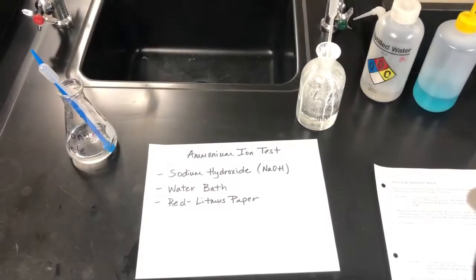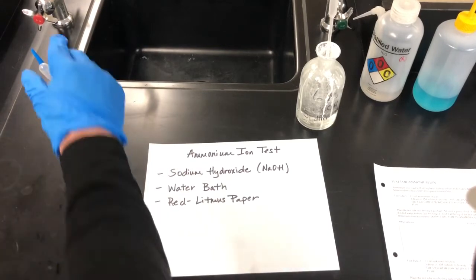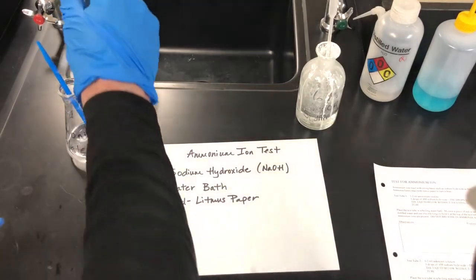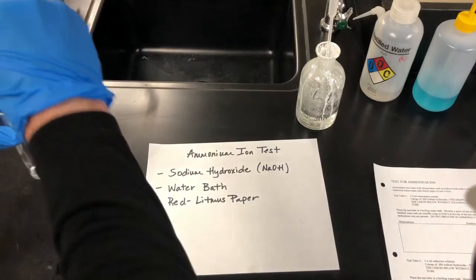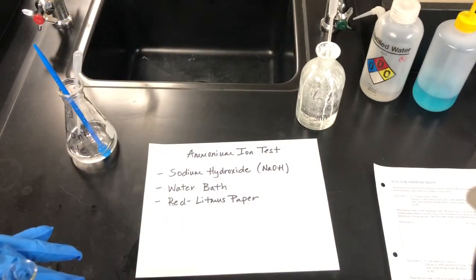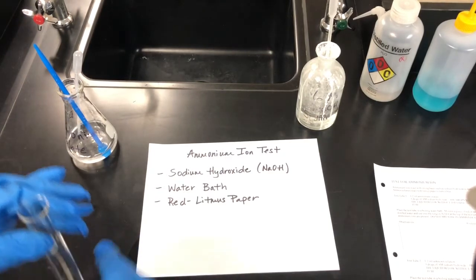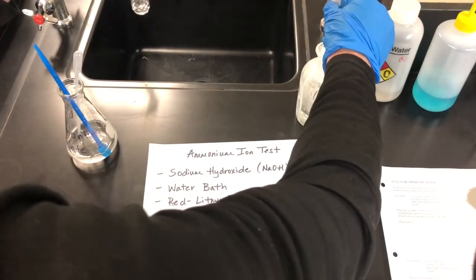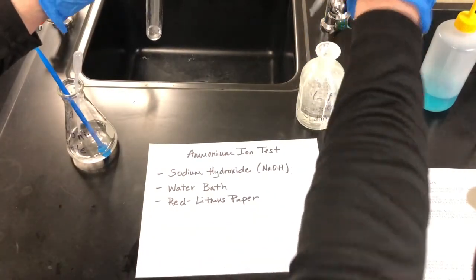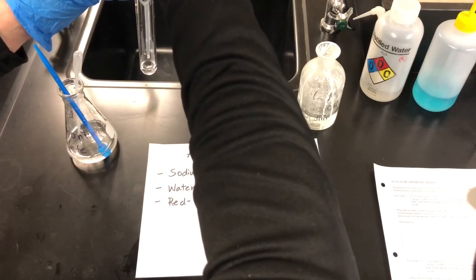Okay, so the last test we're going to look at is the ammonium ion test. The top box says that we're going to take 1 to 2 milliliters of ammonium oxalate. So I'm going to take a squirt of that, put it in my test tube. And it says we're going to mix in 3 drops of sodium hydroxide. The drops must go straight down into the liquid without touching the sides. So we're going to be a little more careful with this one. Straight into the liquid. So 1, 2, 3.